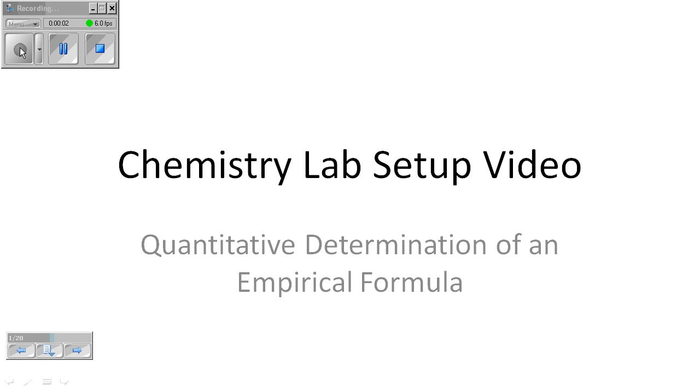Okay, in this video we're going to go through the setup of the chemistry lab called Quantitative Determination of an Empirical Formula. In this lab we will be reacting tin and nitric acid. In this case, nitric acid acts as a source of oxygen. It's called an oxidizing agent. And so the reaction will be between the tin and the oxygen, and so we will get a product which consists of tin and oxygen. It's referred to in the lab as the tin oxygen product.